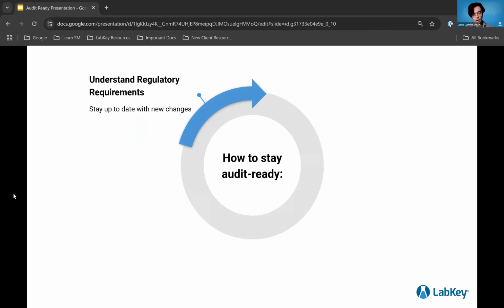You want to go through all of the guidelines that you have from your accreditors, from bylaws and whatnot. These are also going to be updated on a somewhat regular basis. There's always new laws being passed. Sometimes there's new guidelines. We discover new things that we need to do. So you'll want to make sure that your knowledge stays up to date and that you will always go through it all.